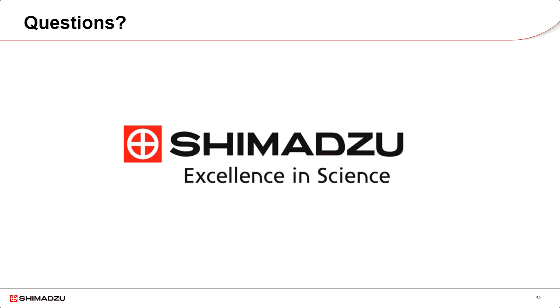All right, so one of the first questions that came in during our webinar today, Steve, we wanted you to go into a little bit more detail about how to transfer your methods from HPLC to SFC. Do you mind delving into that a little bit more, Steve? Sure.